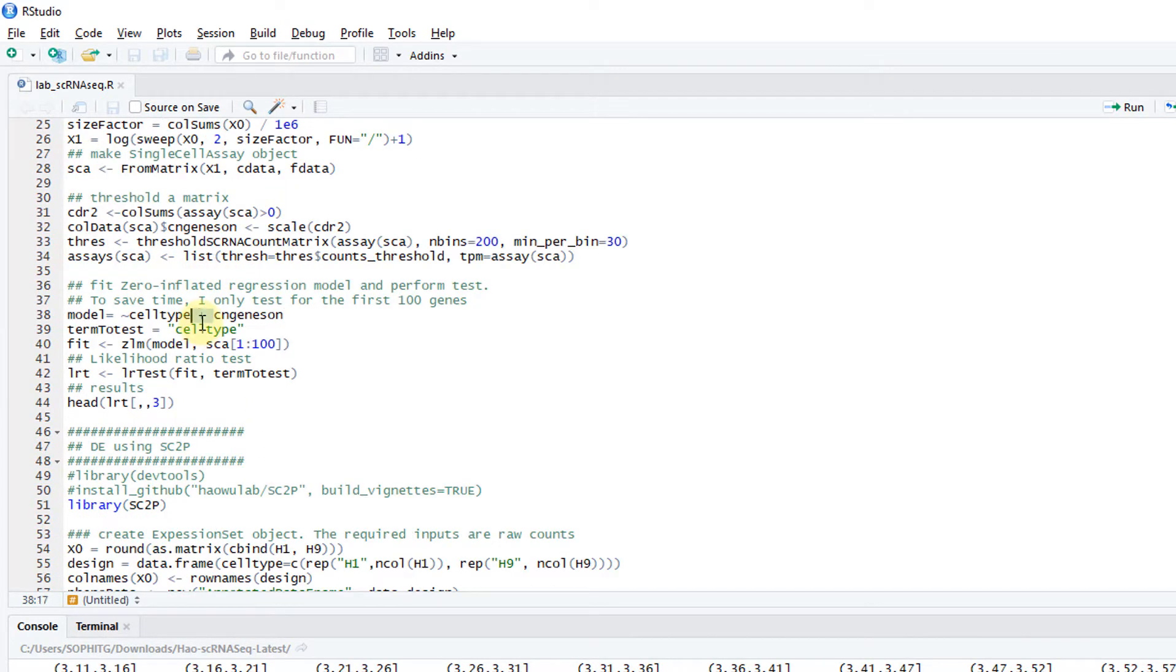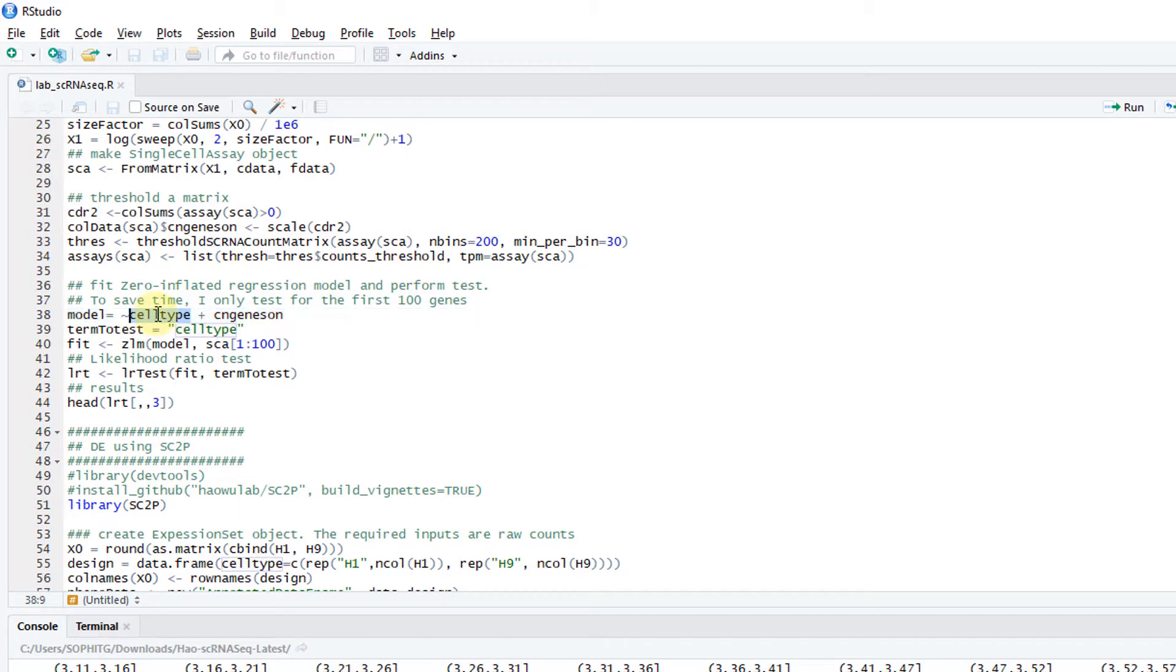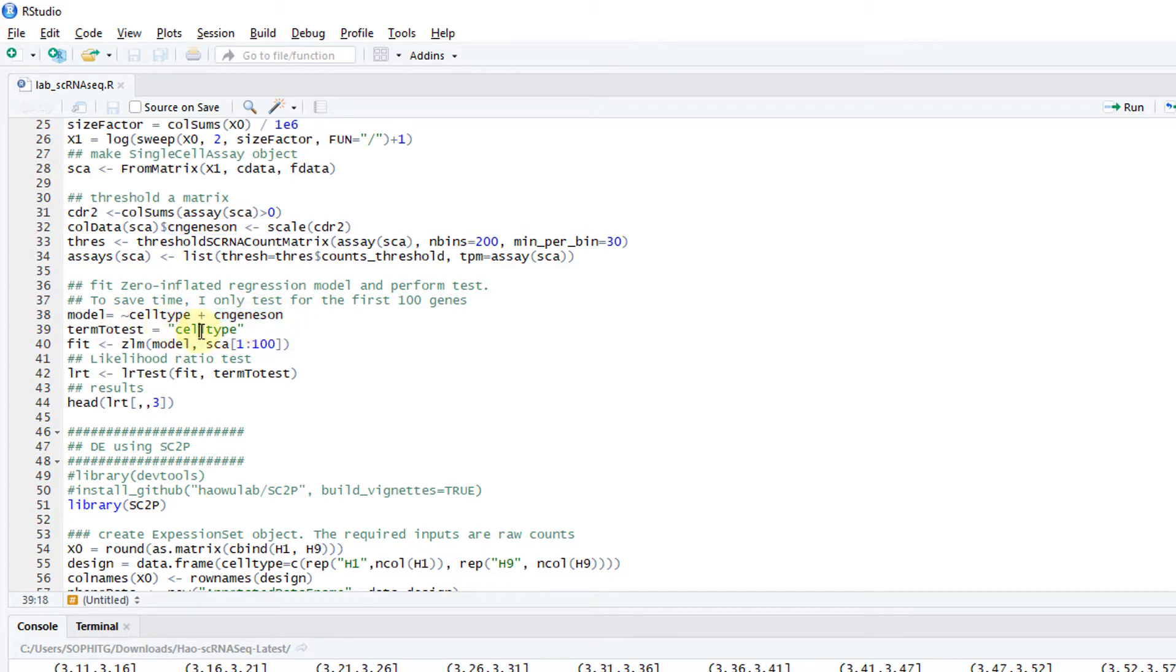Then I can create a model. It's basically the cell type and the CN genes on, the number of genes on. You have to include this one. But I want to test the cell types. Basically I want to compare H1 and H9.